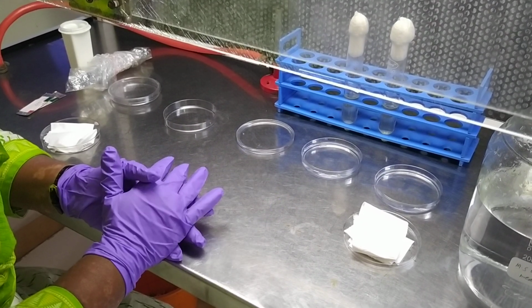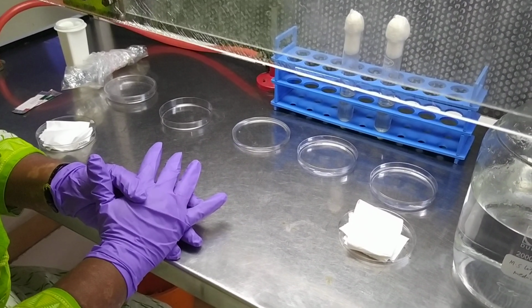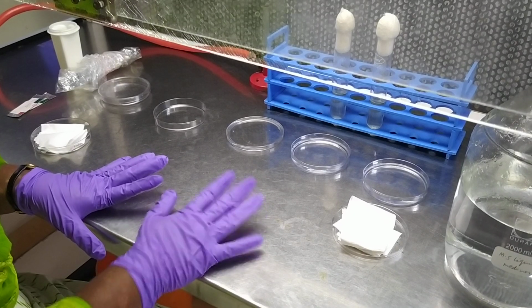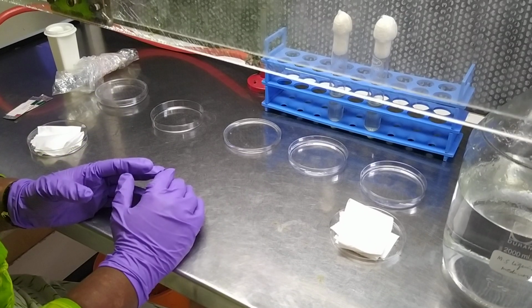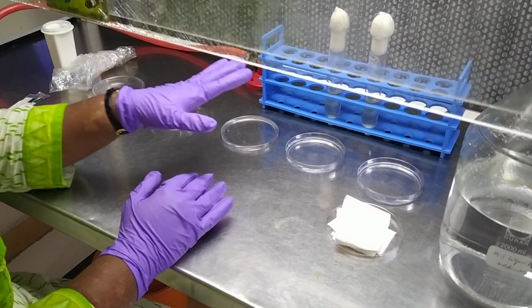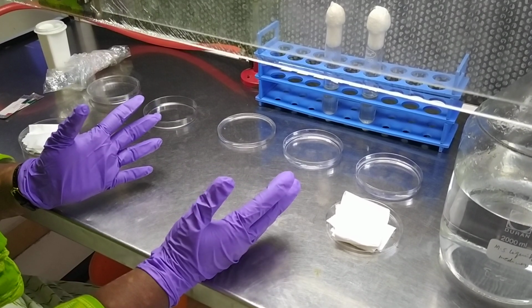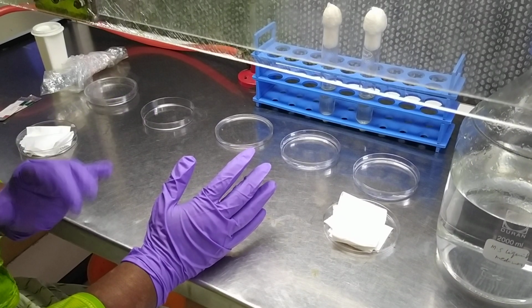As we have seen in the previous experiment regarding media preparation and sterilization technique, in continuation, the place where we are going to do our experiment is most important. Here you will be using your laminar airflow, which you would have come across in your microbiology and the principle behind it. Before starting, we need to wipe the workplace with alcohol, place everything required for the experiment, and then turn on the UV for 10 minutes before proceeding with the inoculation.